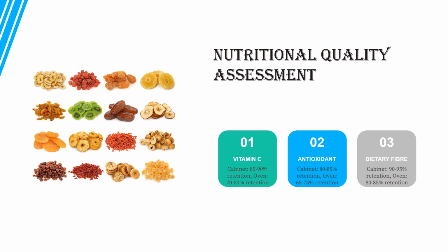85% retention. So in the overall nutritional quality assessment, cabinet has more value in maintaining the nutritional quality. So when compared to oven, cabinet will be good for analyzing the nutritional quality of a product.